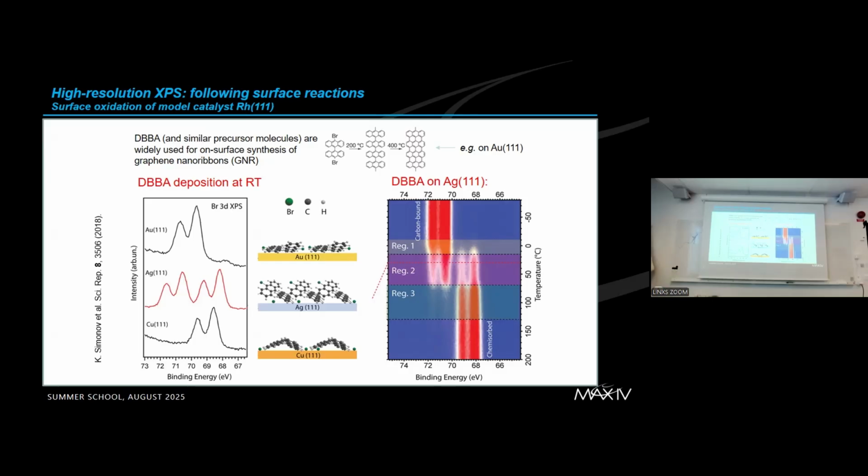The Gaussian broadening, the instrumental broadening, is more relaxed in a way, because I only talked about the instrumental broadening, but in principle it can also include different scattering and randomization processes in the sample. For example, the surface can be rough, and because of that the line can get broader, and this also can be included in the Gaussian.